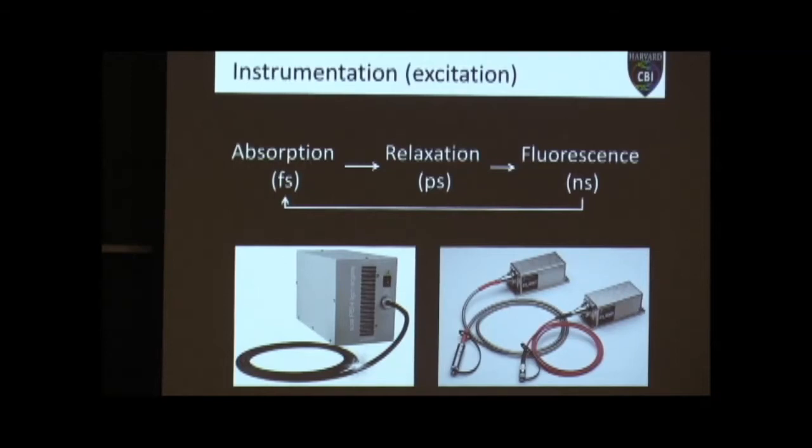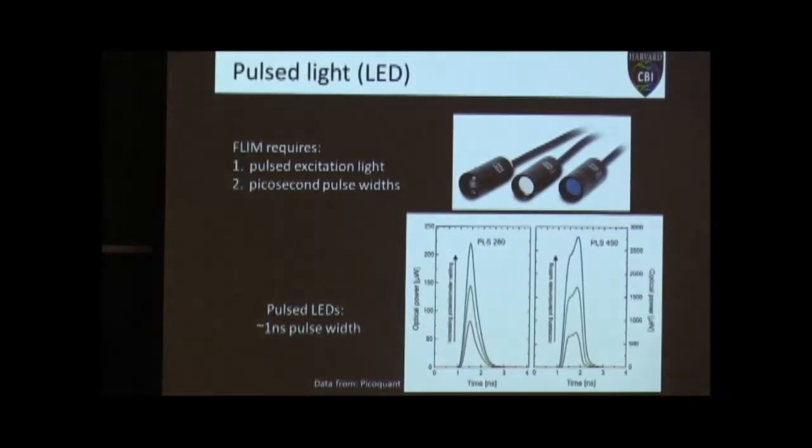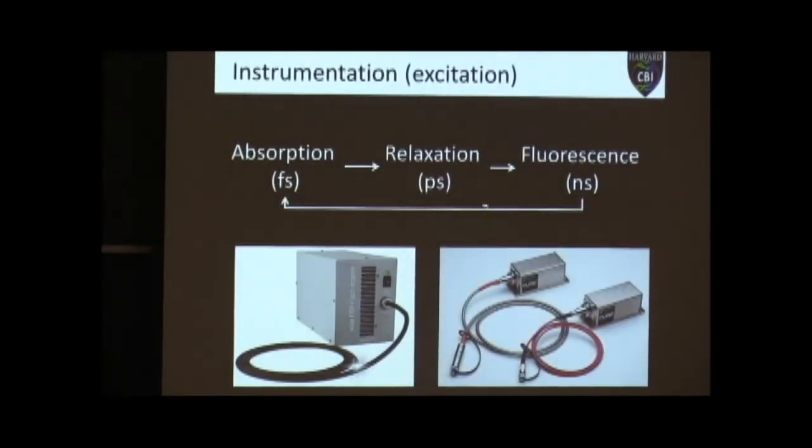So if we didn't have a continuous wave of light, what could we use? This is what's common in all your two-photon lasers. They're all a special type of laser. Pulse, exactly. In the case of an LED, we could just flash that LED on and off really fast. And in the case of a laser, we can use a pulse laser, again, just packaging little packets of photons in time. And what that introduces, it's on another slide coming up, is essentially going to introduce a little delay right here.